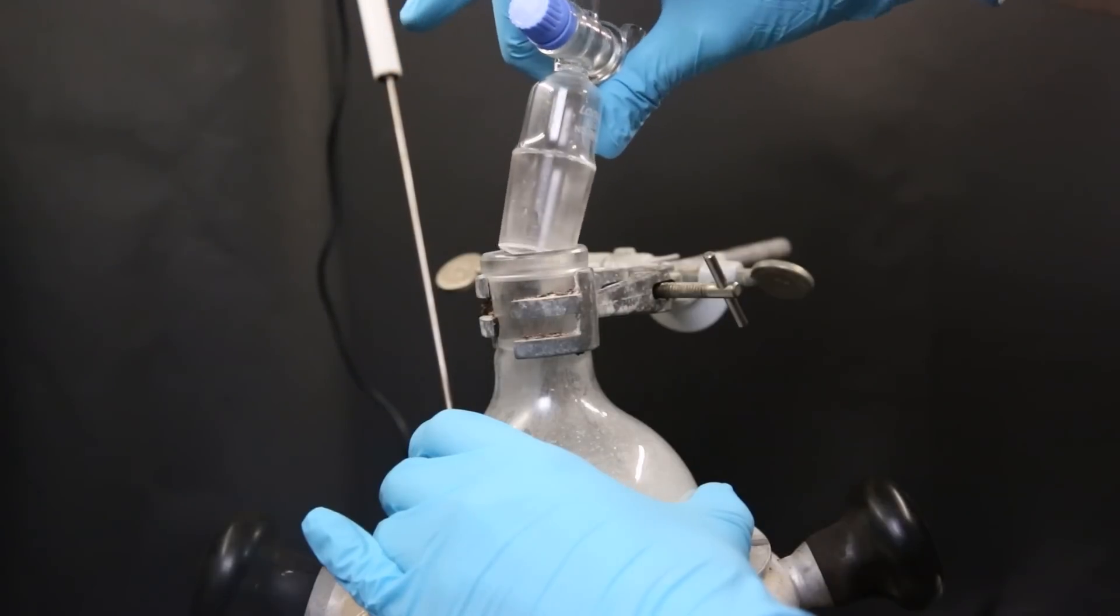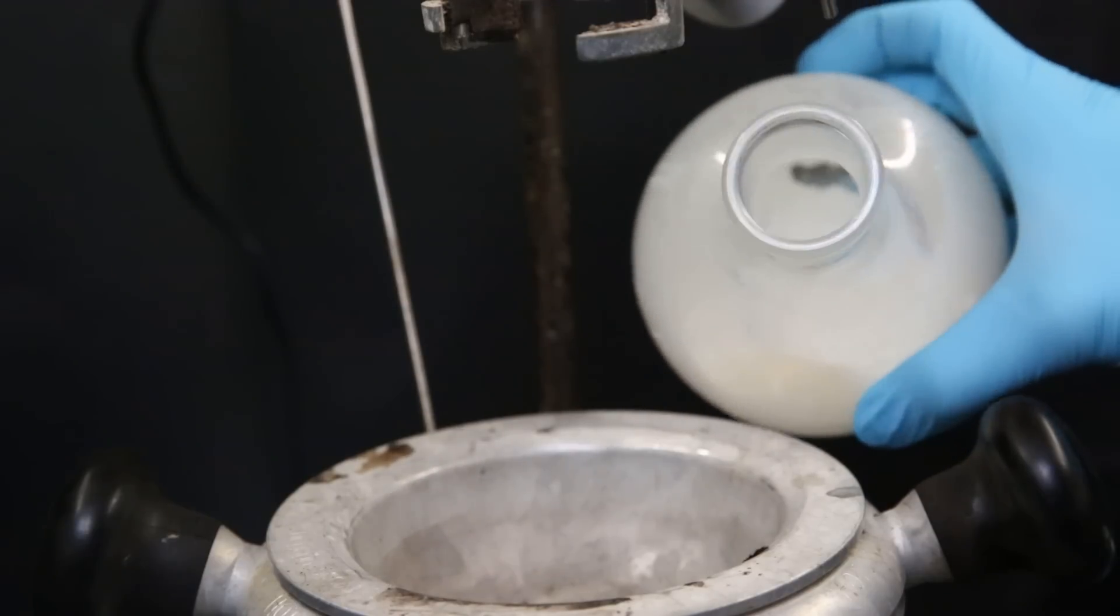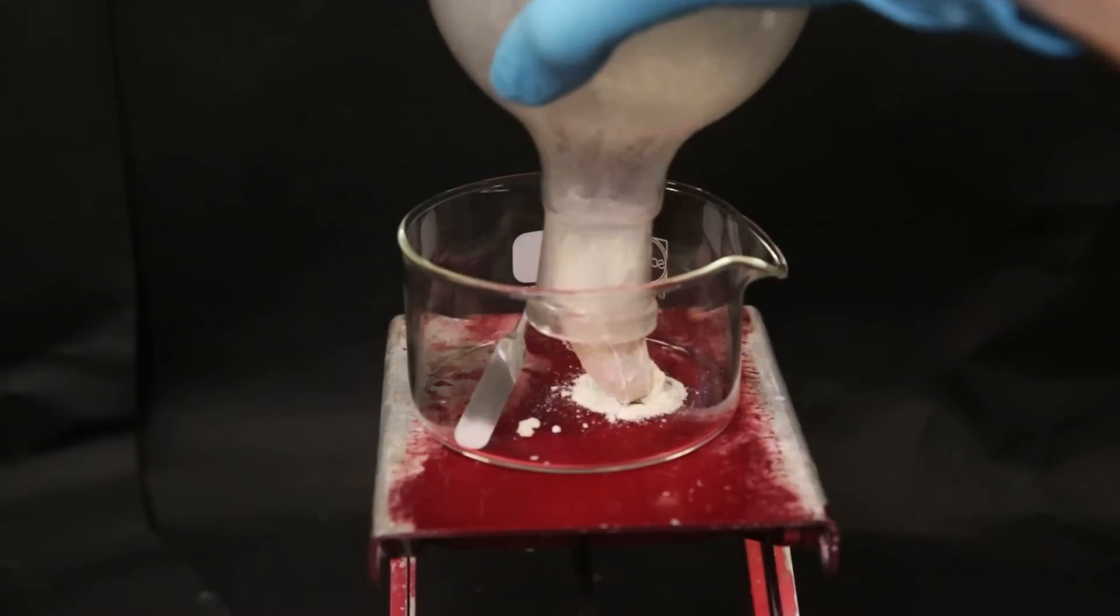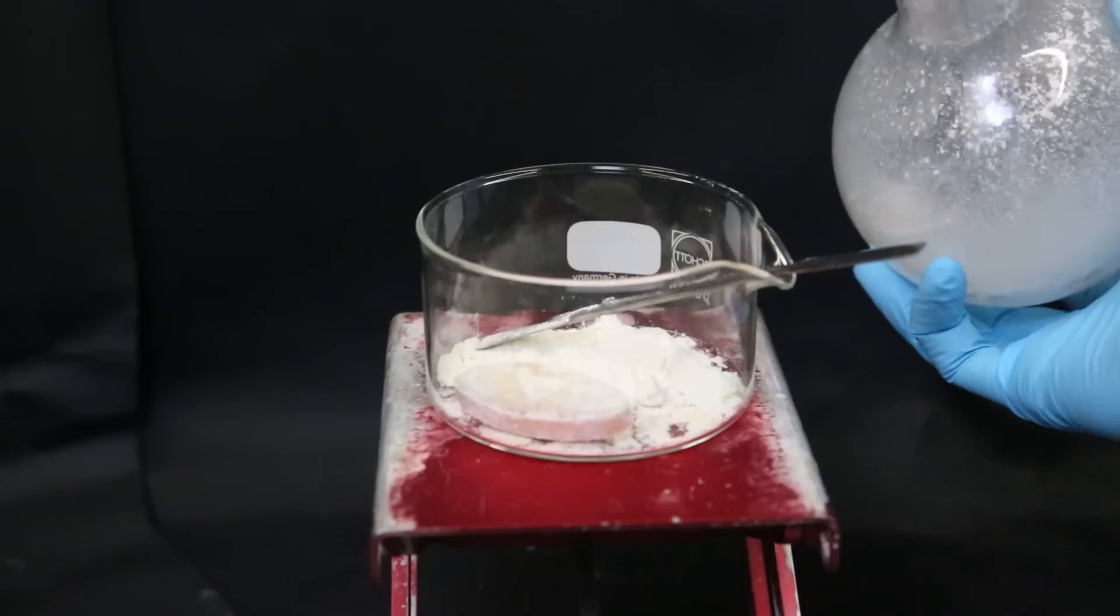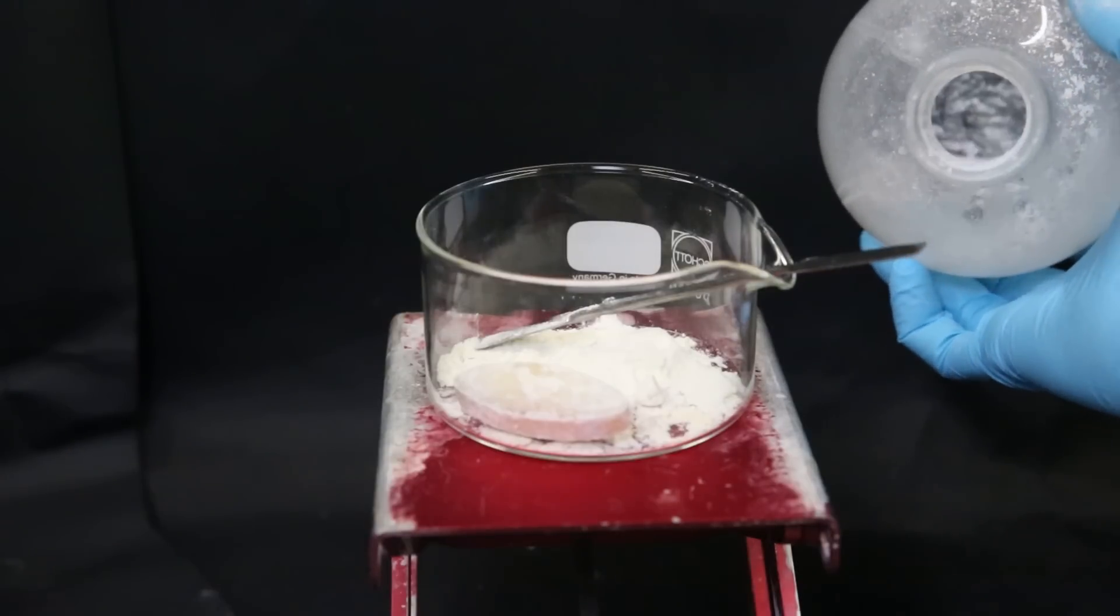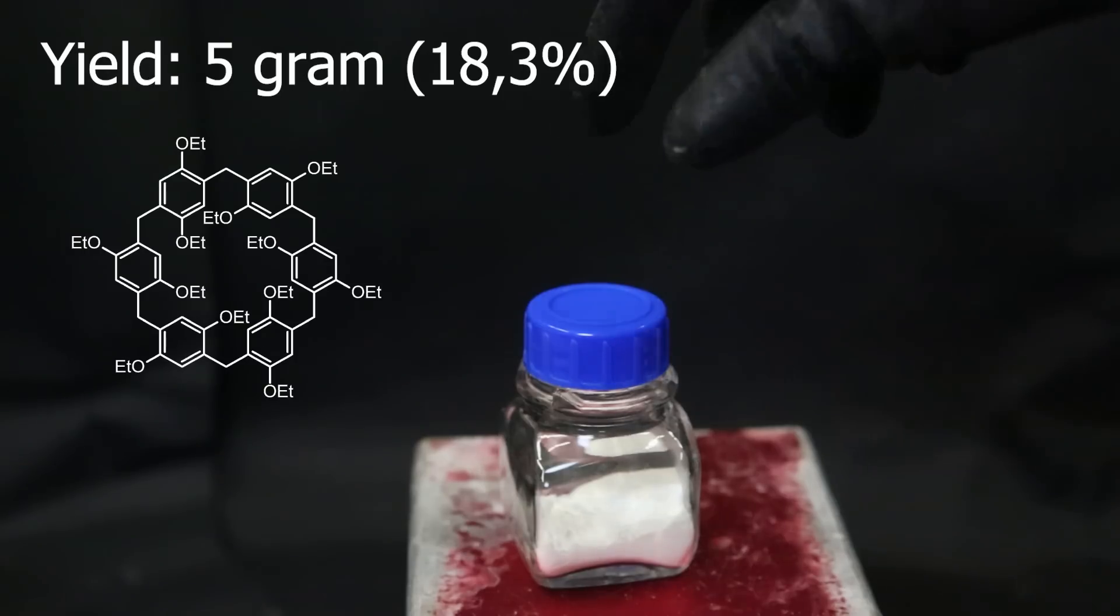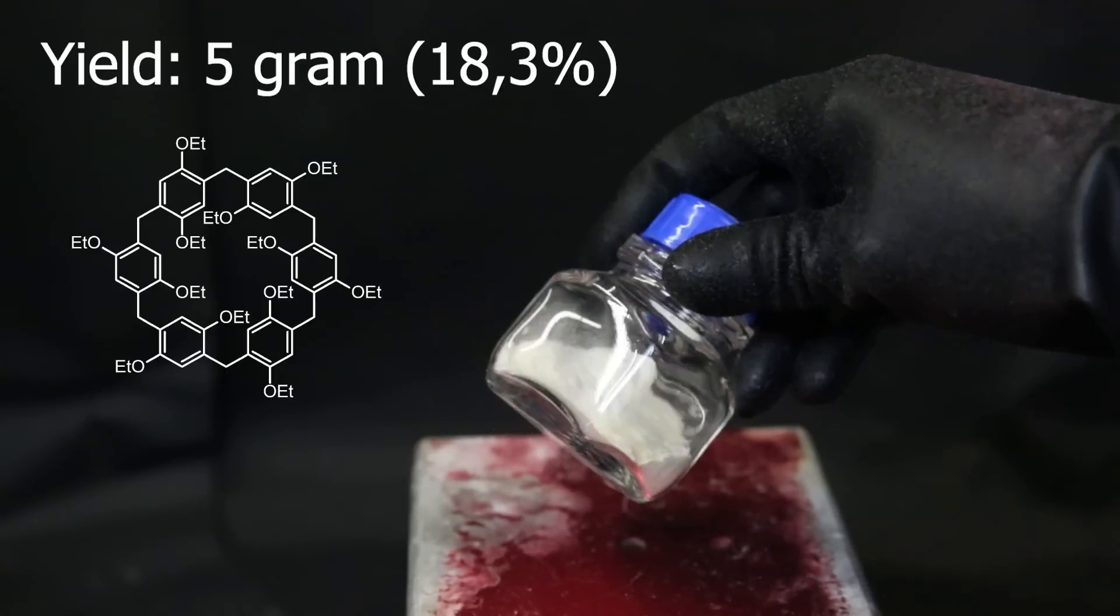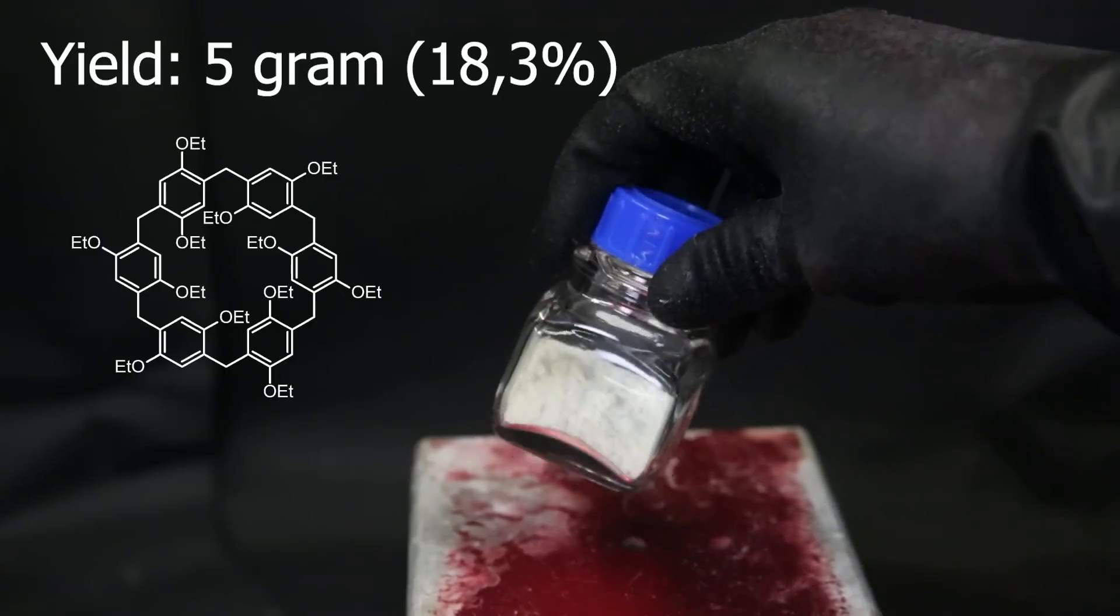I take off the adapter, and when we peek inside, we see a bunch of white powder. So I poured it all into a dish and scraped off as much as I could. In the end, I have 5 grams of product, which corresponds to a yield of 18.3%, but it can still be further purified.